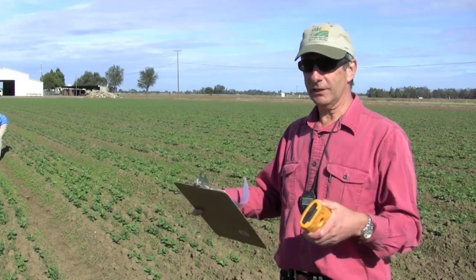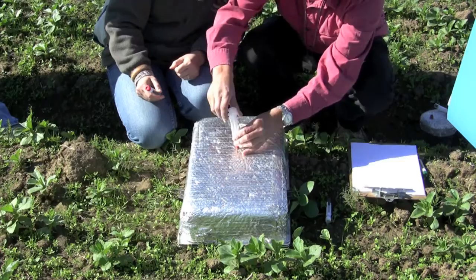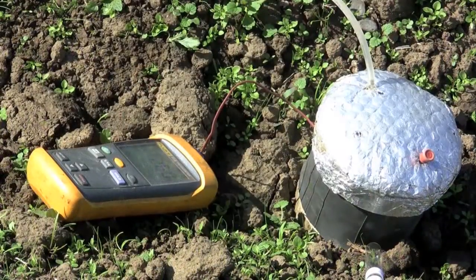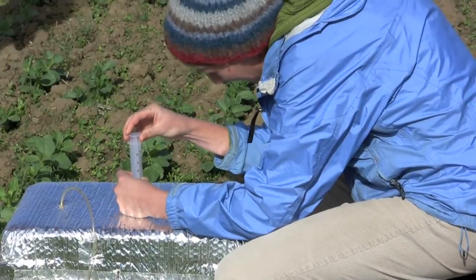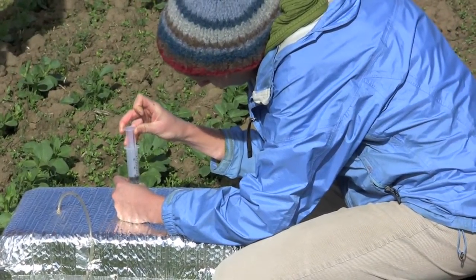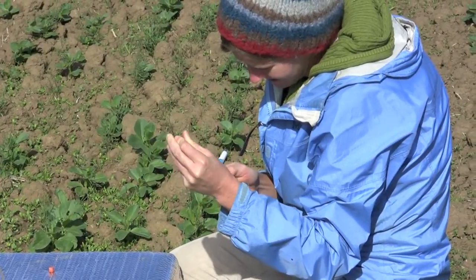We are covering the soil with a chamber and let the nitrous oxide accumulate in there. Then we remove samples at specific times, like at zero and at 30 minutes and at 60 minutes.